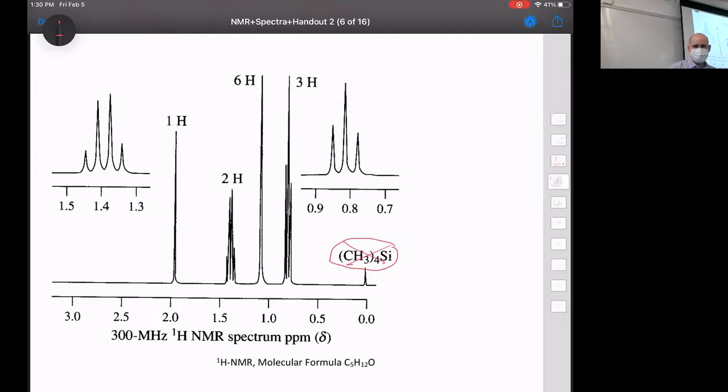So let's put it all together in the way that we're used to. This is 1H, and what's the splitting on this guy right here? Yep, so it's a 1H singlet. And you can tell that the chemical shift is at like 2.0 ppm. That information right there is pretty much what we've been using to build environments.